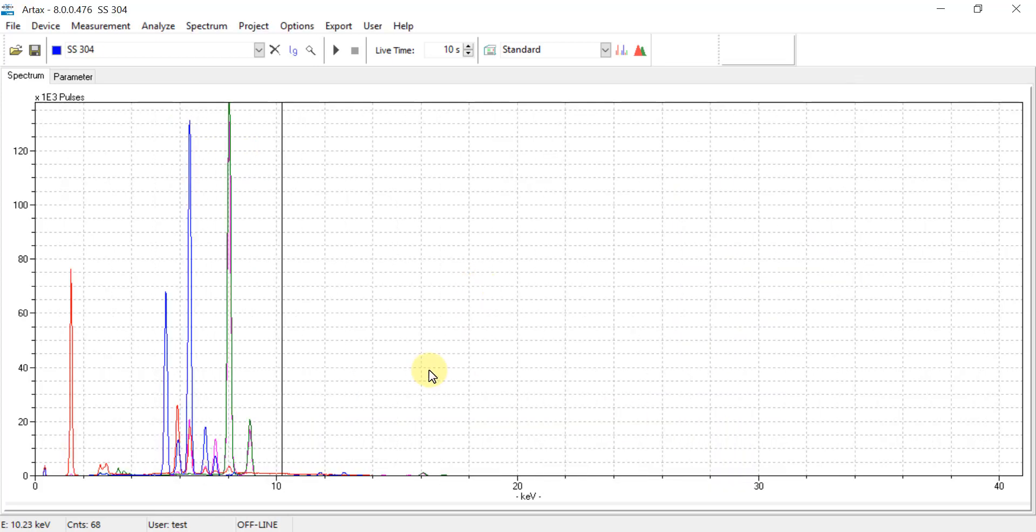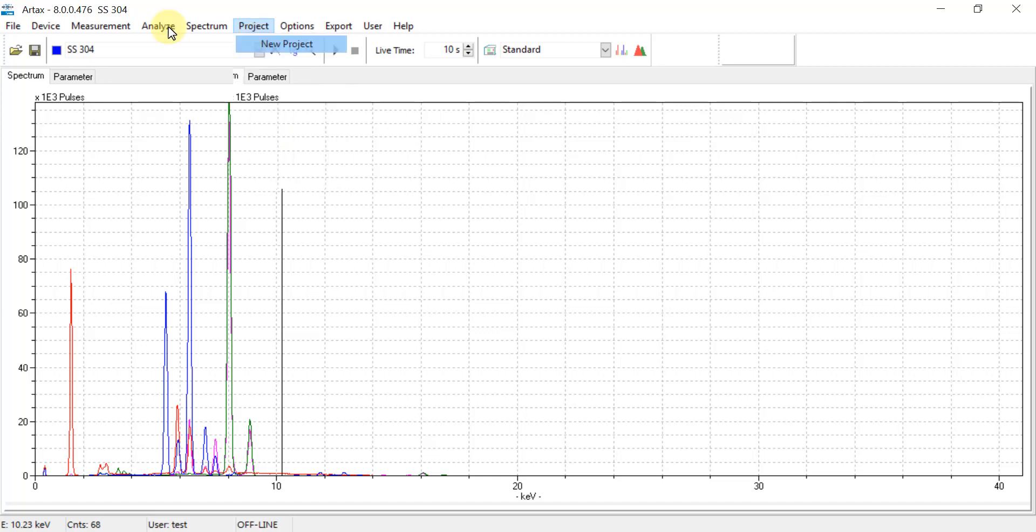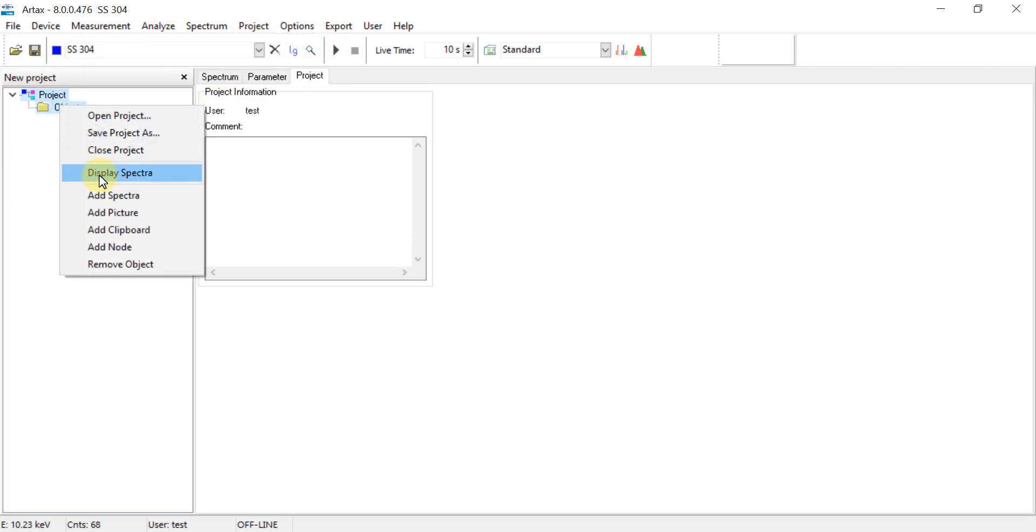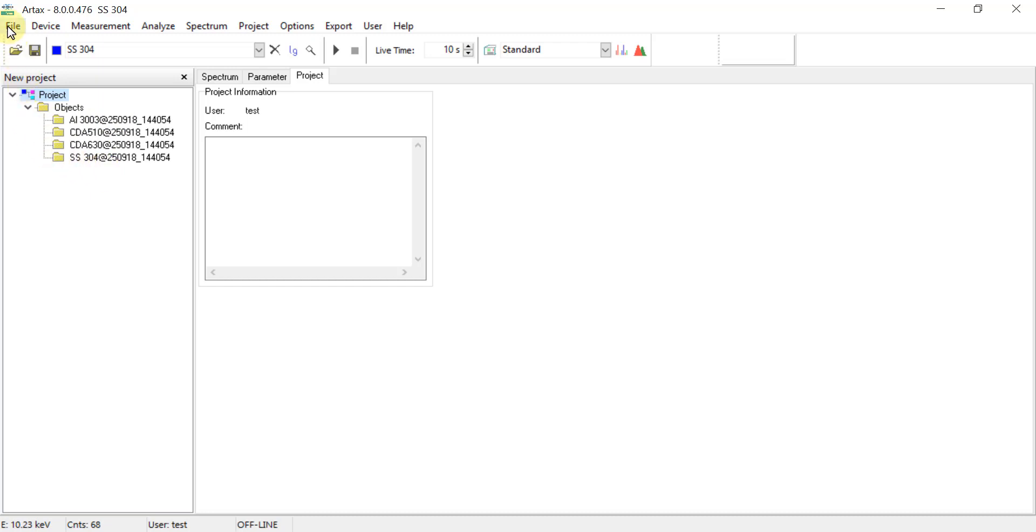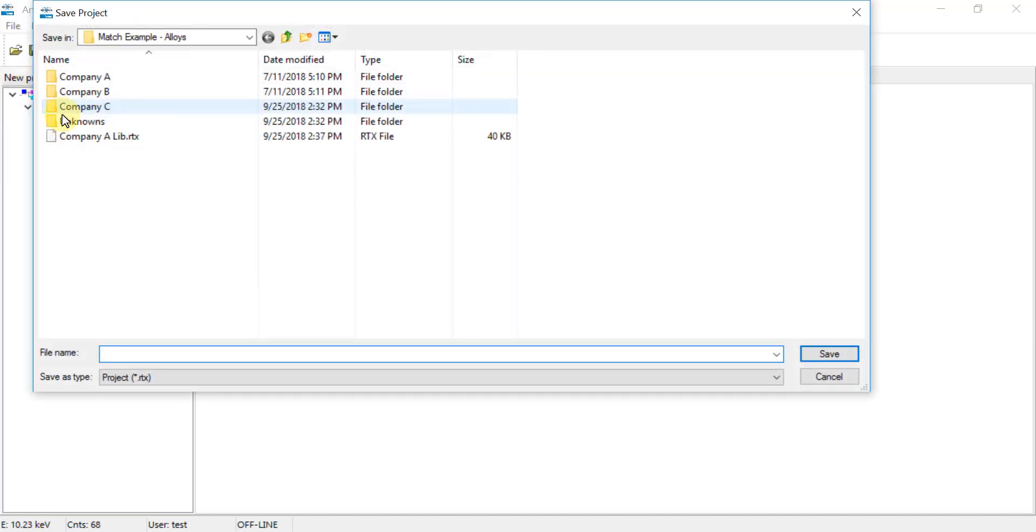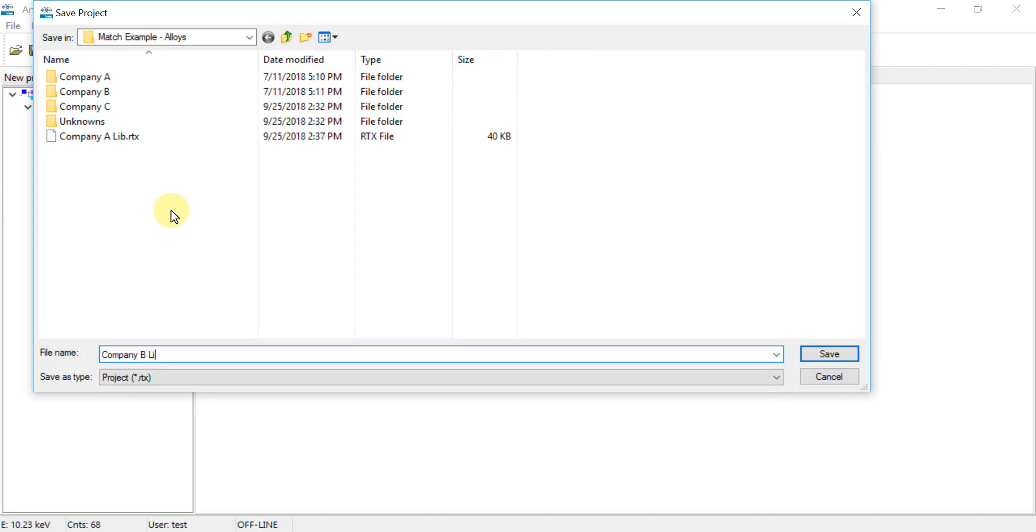Since this is going to be a separate library, we go back to Project and select New Project. In the Objects folder again, right click and select Add Spectra. Now again the second group of PDZ files have been added to this project. So we can go to File, Save Project As, and give this .rtx file a name and then hit save.